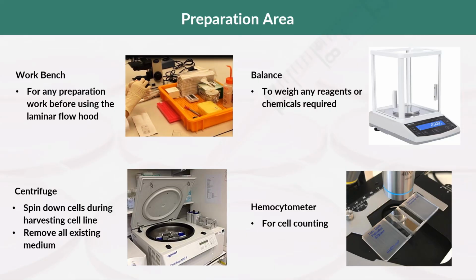Okay, there are many kinds of centrifuges, many sizes, many models available. They even have accessories such as your rotors. Rotors, that is, they are interchangeable rotors.